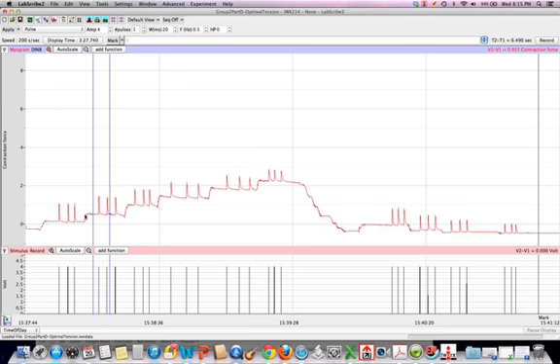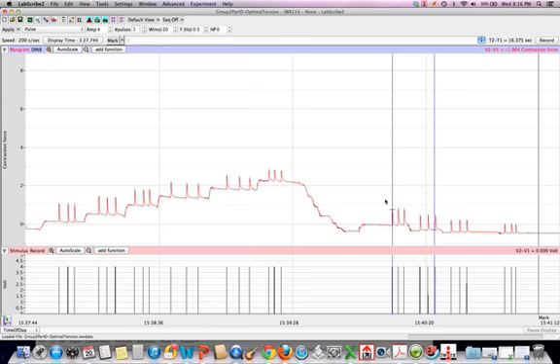One thing that you can see though is that the peaks here look taller than they do here. They're kind of getting smaller and smaller. So this is probably closer to our optimum amount of tension that we have on the muscle for our contraction. What the experimenters did here is that they ended up loosening it by 1 turn and taking some measurements to see how tall they are here. And my bet is that that is not looking that good as far as the height, and we can just check and see how it compares to our first one.